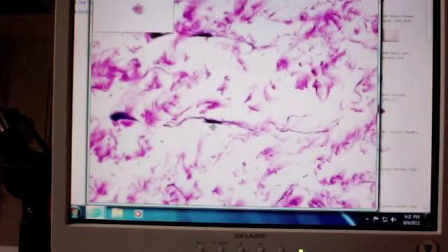If I put a pointer and I said, name, this is the nucleus of what kind of cell? Fibroblast. Why? Spindle shape, long and skinny. Okay. The cytoplasm is staining very similar to the collagen fibers, correct? Okay, so that's why the cytoplasm is not that visible here.